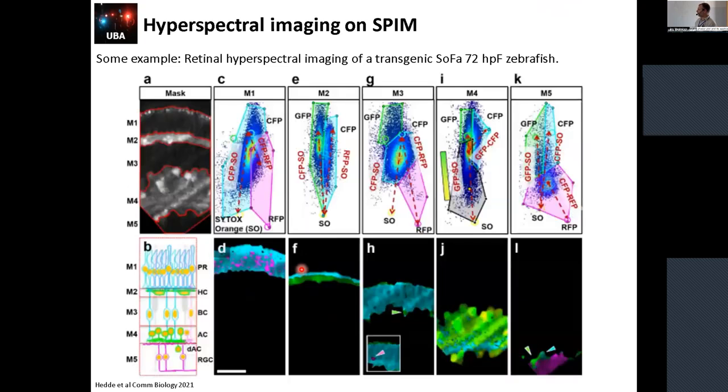And if we isolate a region of interest in the image and look at the linear combination, what we discover is that we recover exactly the linear combination that is expected for the different regions. So when you have, I don't know, cyan and green, it means that you have this protein or this cell. When you have this other, this other. And this is really the power of the phasor in order to understand very complicated things.